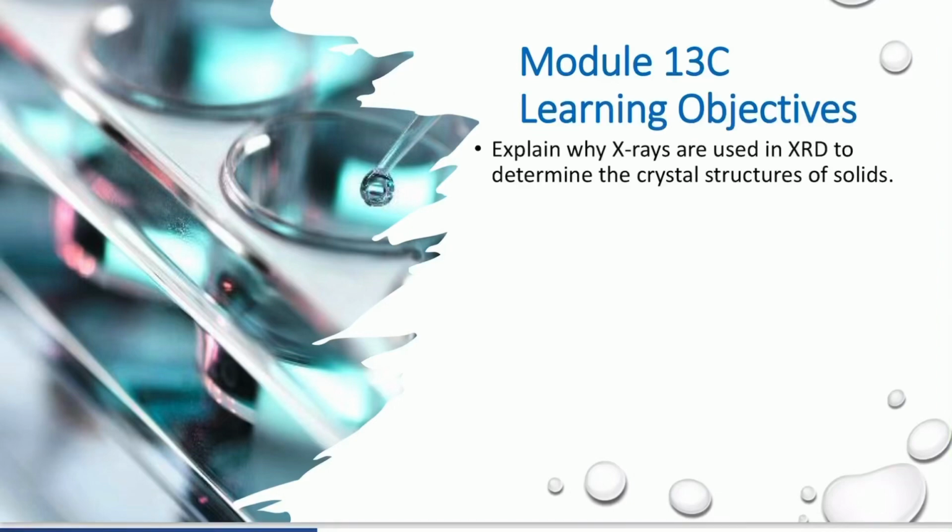Module 13C, we're going to start looking at X-ray diffraction, and so you can actually see how we can determine these crystal structures for solids. So I'll be able to explain why X-rays are used in XRD and determine the crystal structures of your solids.